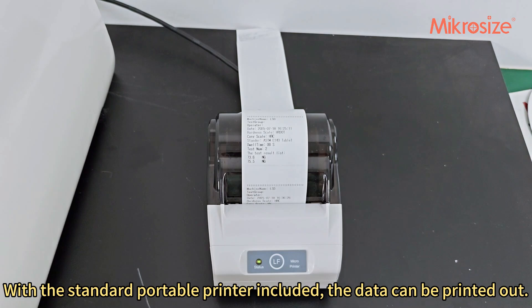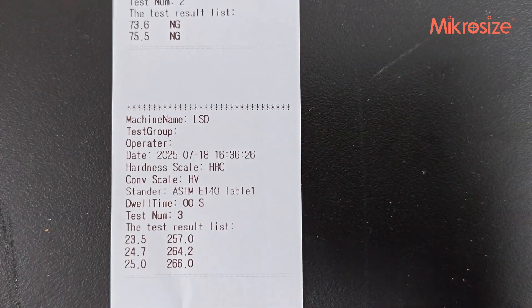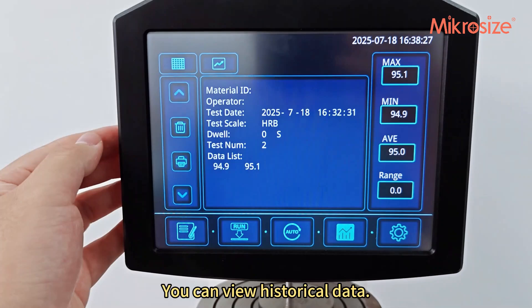With the standard portable printer included, the data can be printed out. After selection, incorrect data can be deleted. You can also view historical data.